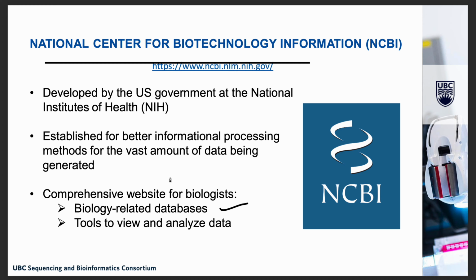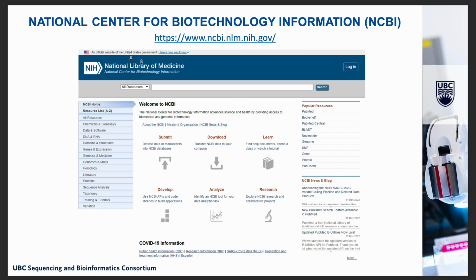Currently, it includes a comprehensive website for biologists, biology-related databases, and several tools to view and analyze data. And this is the home page of NCBI.